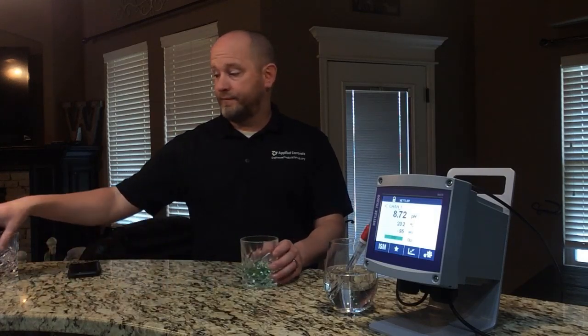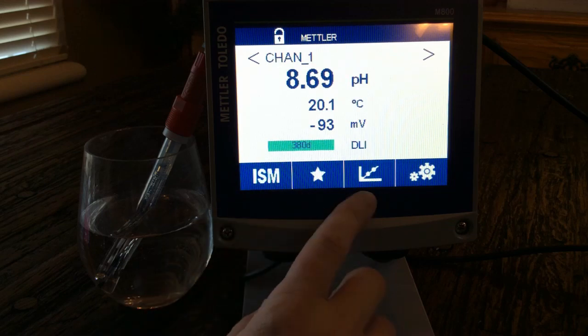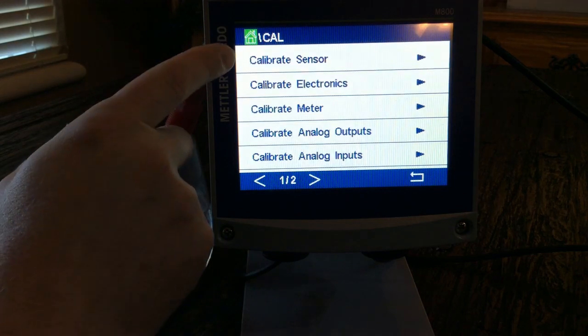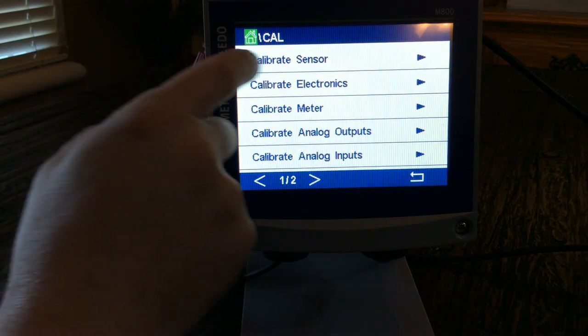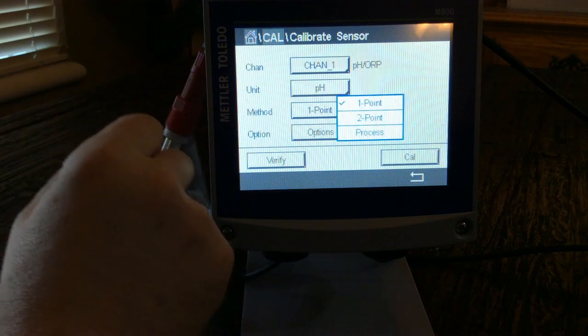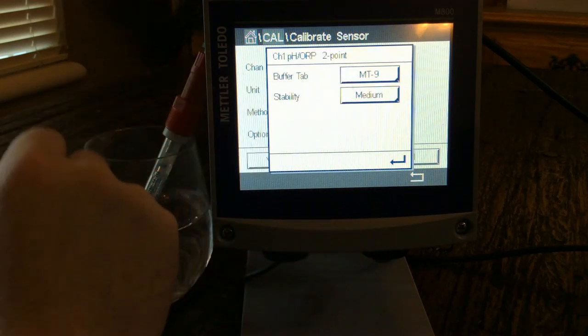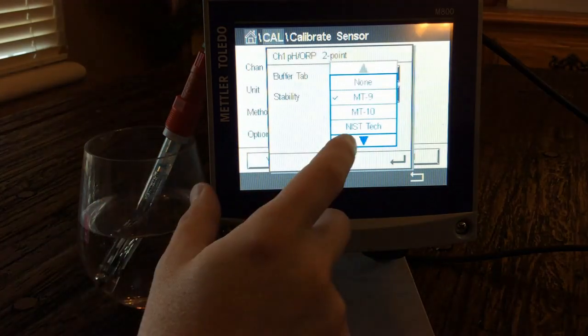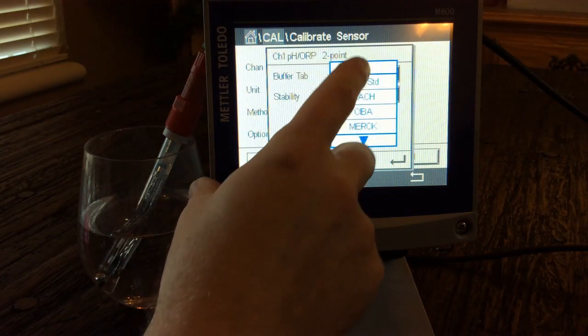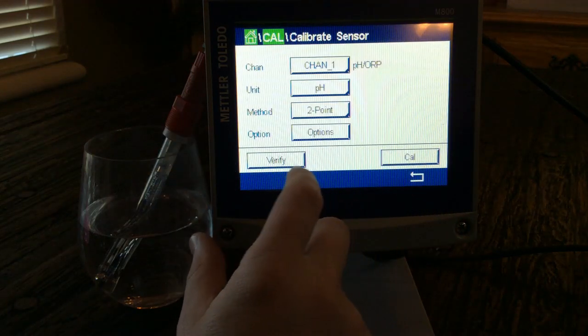I've got my 7 and my 4 buffer, and my cleaner, and we're going to walk through the calibration process. You do this through the transmitter using the calibrate button. We select calibrate sensor, choose channel 1, pH, and I want a 2-point calibration so I'll change that. Under the buffer tab, I'll select the appropriate buffer and quality setting — good — and we're ready to go.